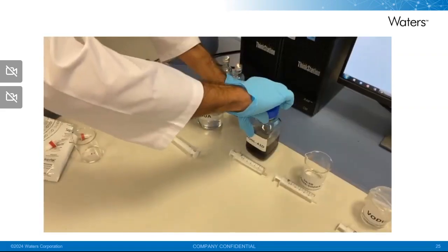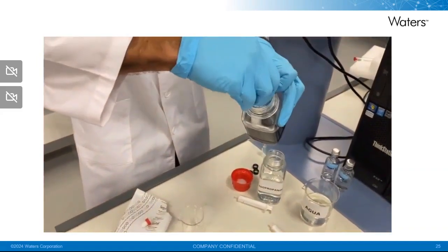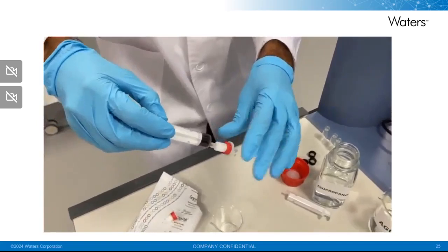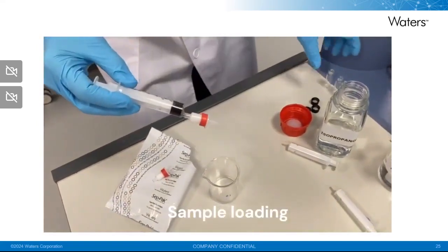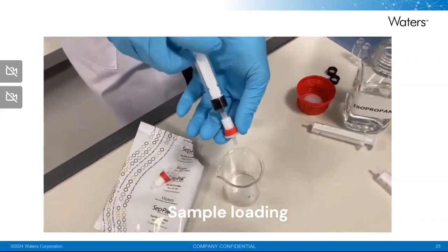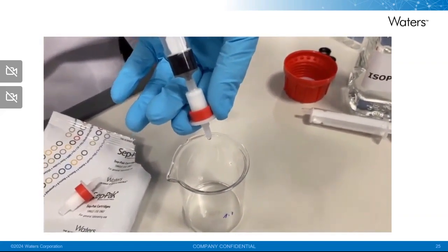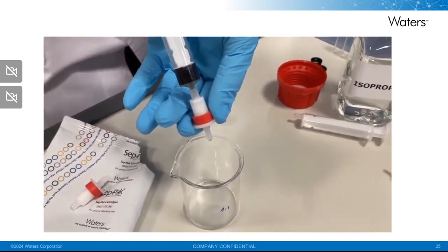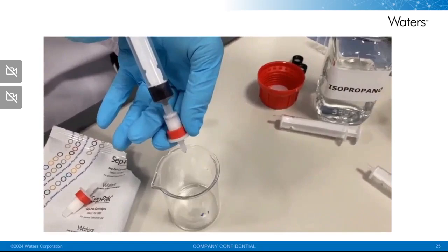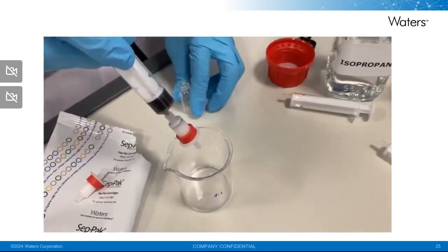Once equilibration is finished, we load our sample. And at this point, it is critical to load our sample slowly. We typically say that we need to allow some time for the analytes to interact with the sorbent, and for that we have to load slowly. We say that approximately we're going to be loading at a speed of 1 drop per second.